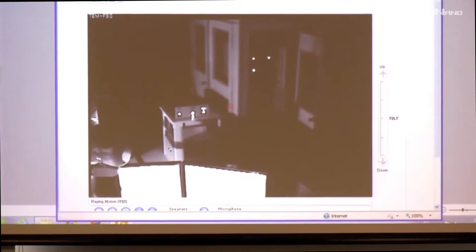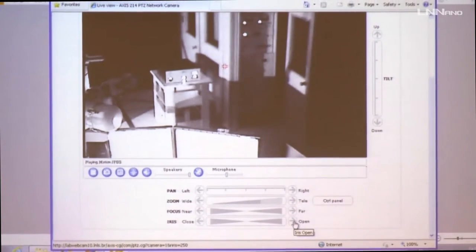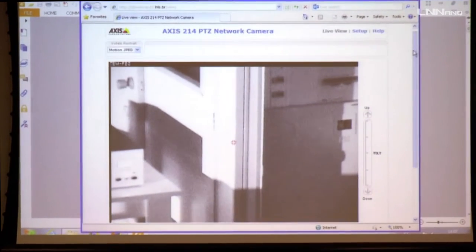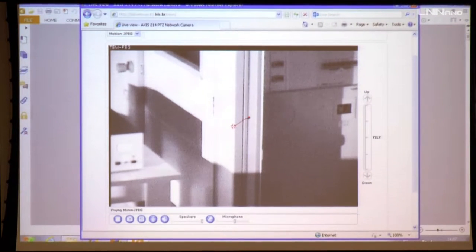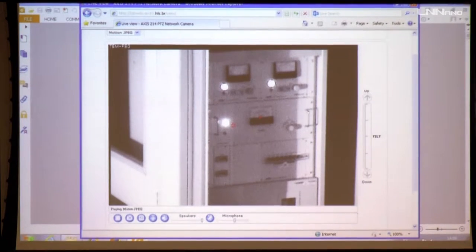I just want to show you where exactly the vacuum levels are. This is the place where we need to check the vacuum configuration, but here I don't think we can see properly. Anyway, this is the indication of the gun. There is a very faint line here. We can see that it's less than about 1.2 times 10 to the power minus 5.